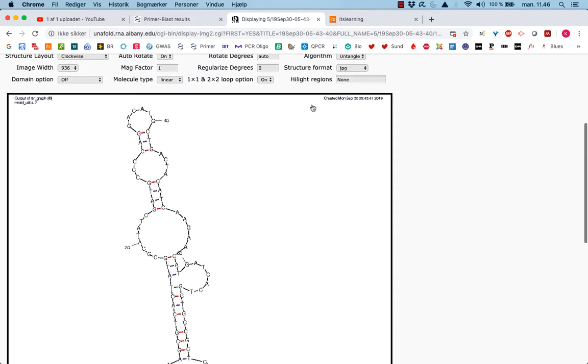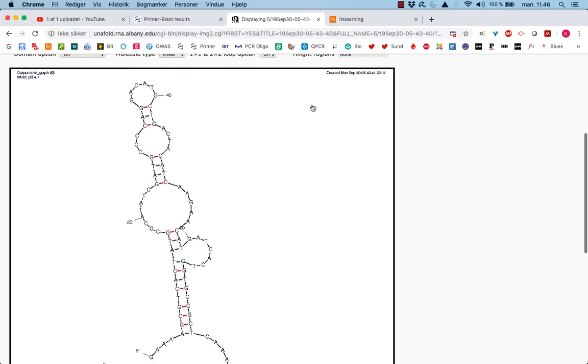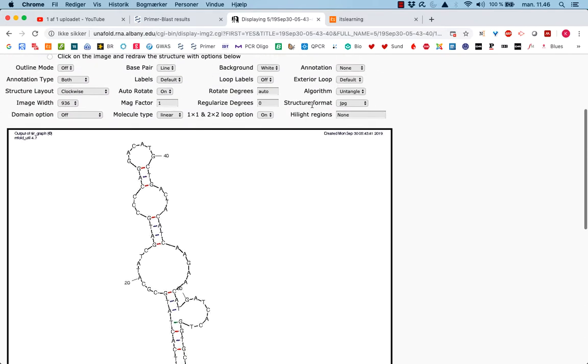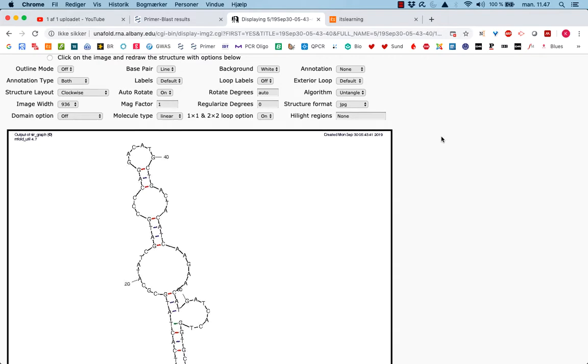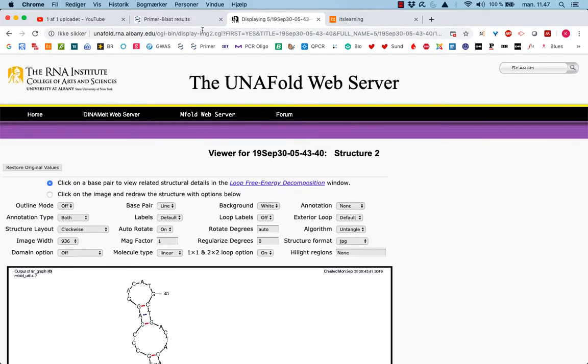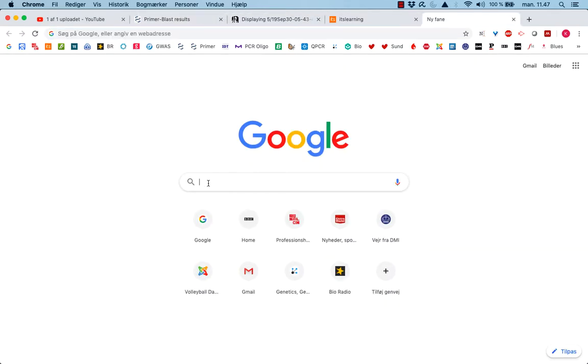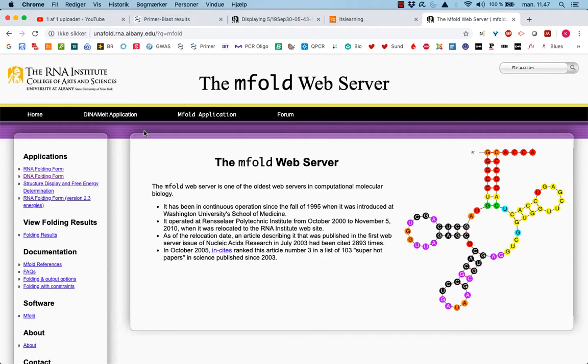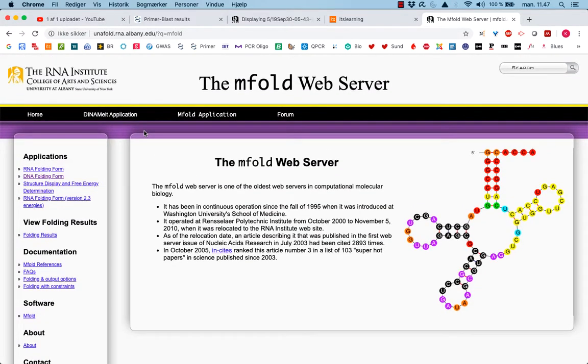Based on this, I would go through the other primer pairs designed and see if we've got less problems over there. It might not be a problem, but it can be that you will get an amplification but at much lower efficiency than you would like to have. So, this was Mfold. The address is in the presentation I give you on the website. It might be different because it sometimes moves servers. So the best way to find it is simply to go to Google and say Mfold. That was it about Mfold. Good luck with that.